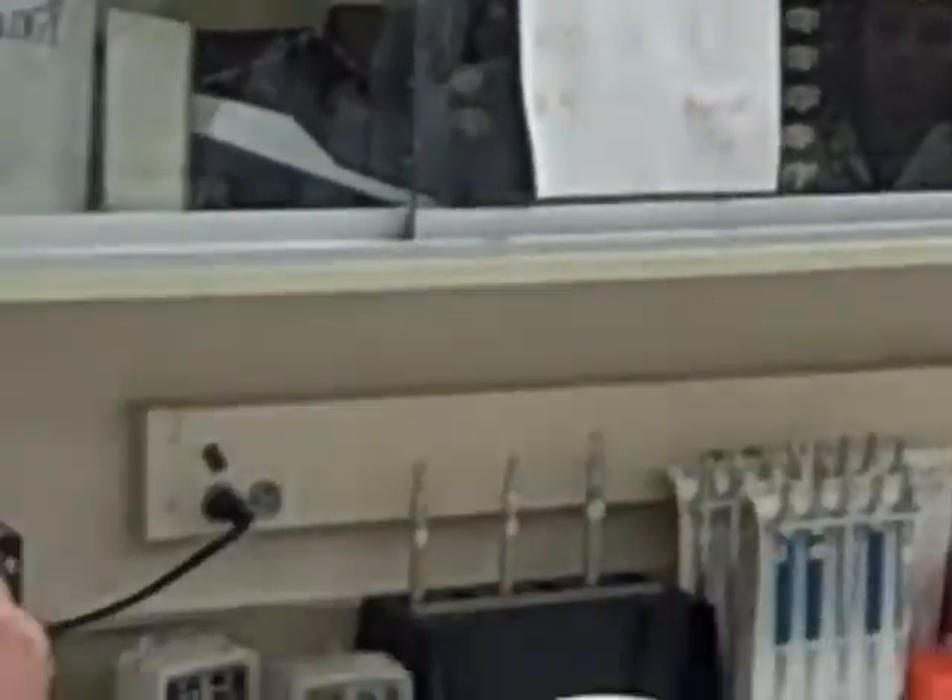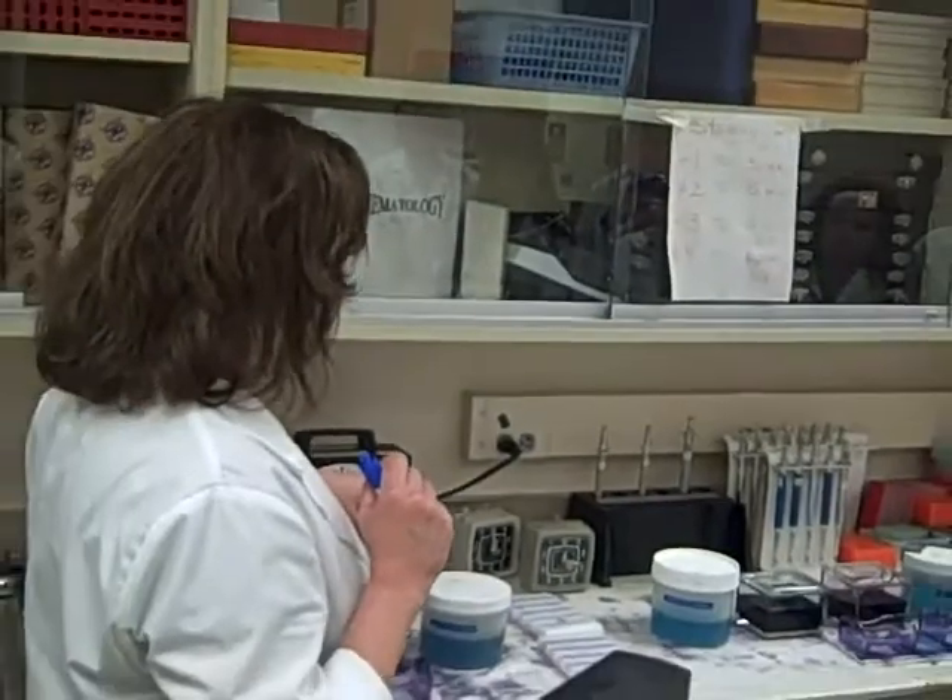Next, take it out of there, blot, it goes in the next station, which is our Wright buffer station.